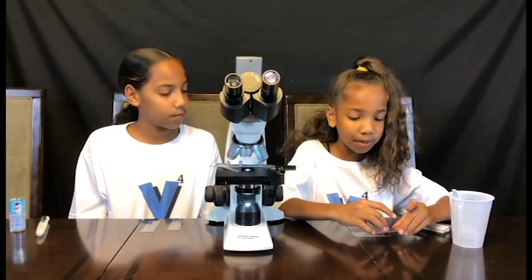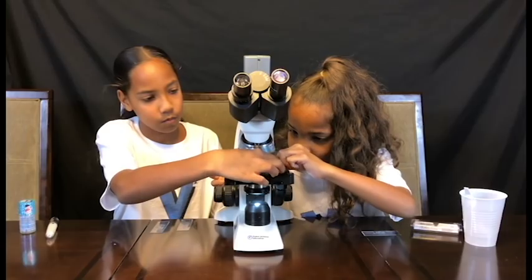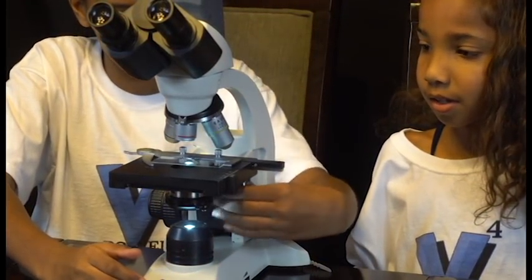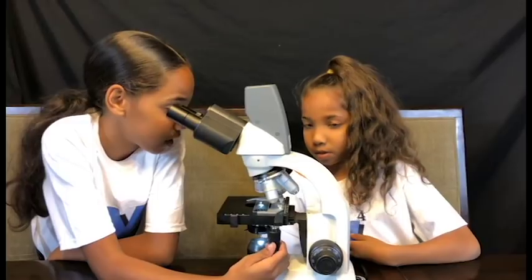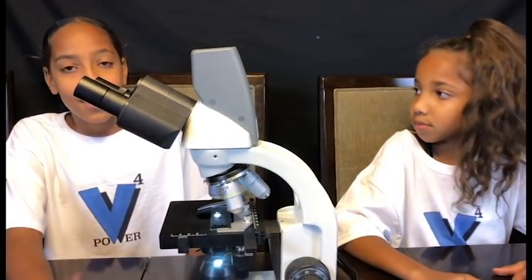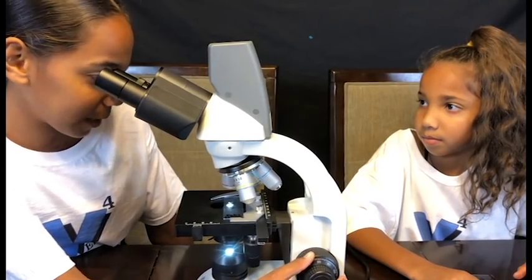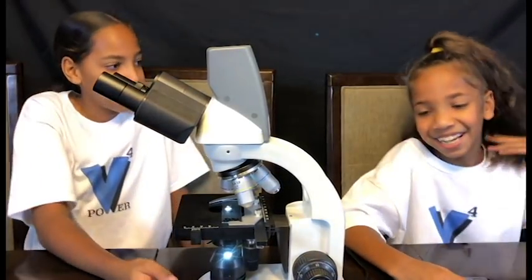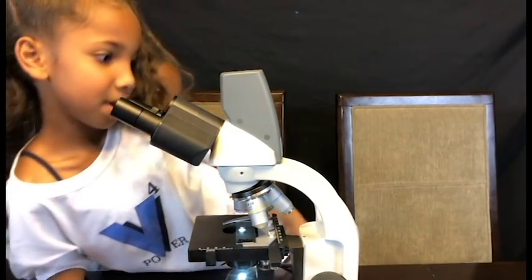Now I'm going to be doing the eyelash first. Time to adjust it. I have to move this until I see something. Okay, now it's like gray — now we're gonna focus it to see how it looks. Whoa, they look like burnt french fries or spaghetti! It looks like burnt spaghetti or french fries, like she said — guys, you have to see this!